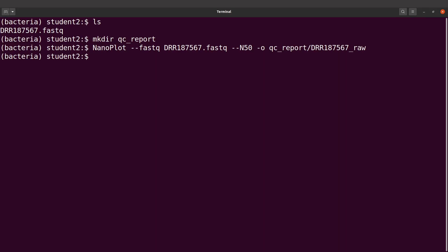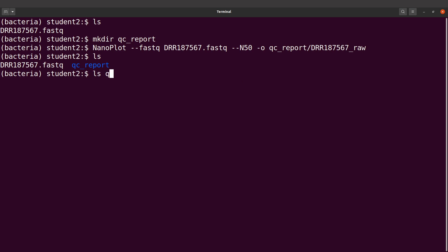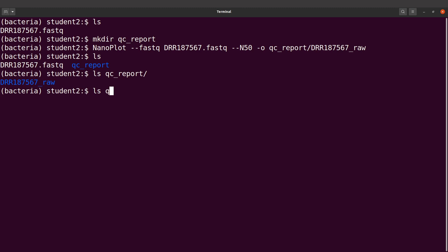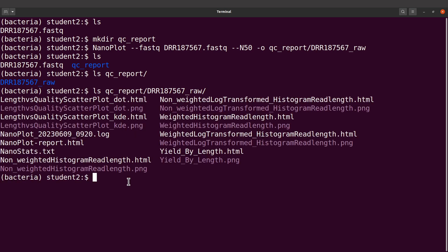QC has been performed, so let's do an ls. We are going to find our directory here — this is what we created. Inside it we have the results. I'll say ls qc_reports, and then ls into the subdirectory to display the contents. We have plots, HTML files, and text files. We are going to look at some of them quickly using the file manager.